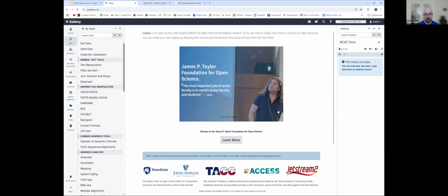In the middle section, where you'll see the scrolling carousel with information, is your workspace. Whenever you open a tool form or look at a visualization, it's going to populate here in the middle, and you'll always have access to this activity bar.